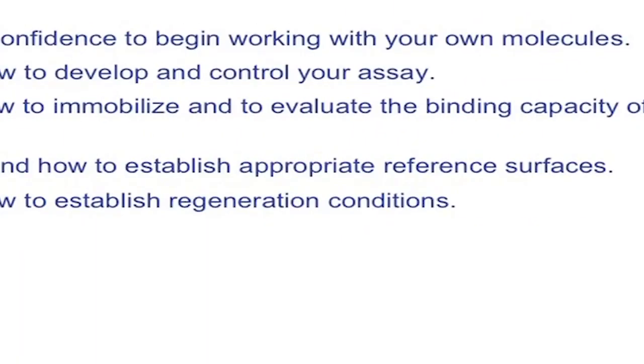In this session, we will understand how we can develop an assay, a Biacore or a surface plasmon assay. The objectives of this particular study are to understand how to work with the molecule, how to develop an assay, control an assay, we will understand about the reference surfaces, and we will also understand about the regeneration of the surfaces and all that.